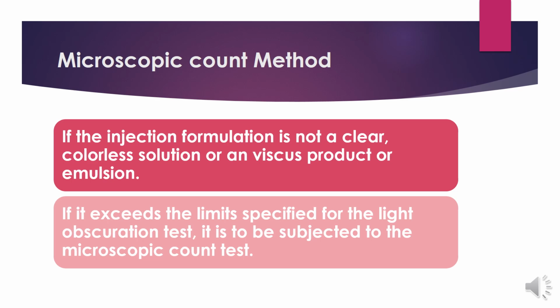It says if it exceeds the limits specified for the light obscuration test, it is to be subjected to the microscopic count test. Means if in the light obscuration method, or even in the first method, the limits described for the tests are exceeded, further confirmation is done by performing the microscopic count test.